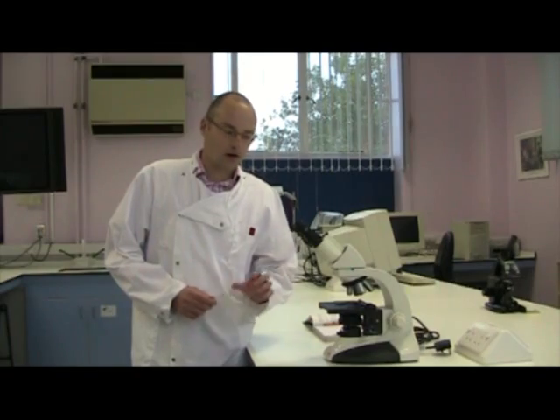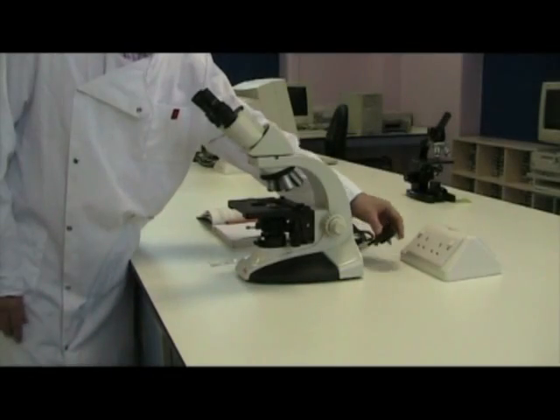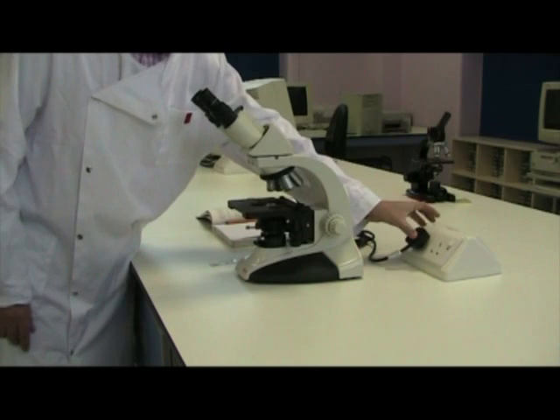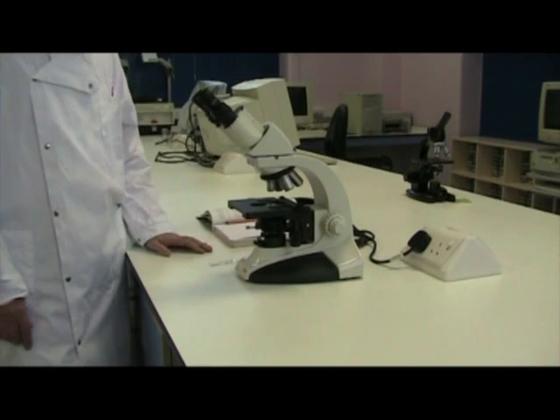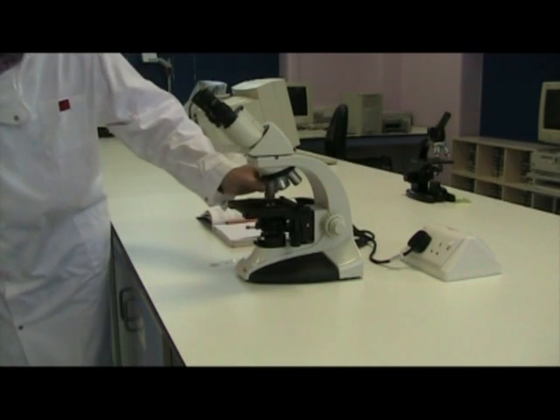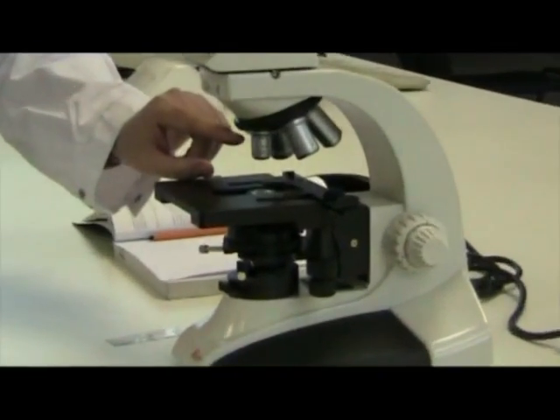In this video, I'm going to show you how to set up a compound binocular microscope. First of all, plug in the microscope. Then select the low power objective. The low power objective is usually coloured red.